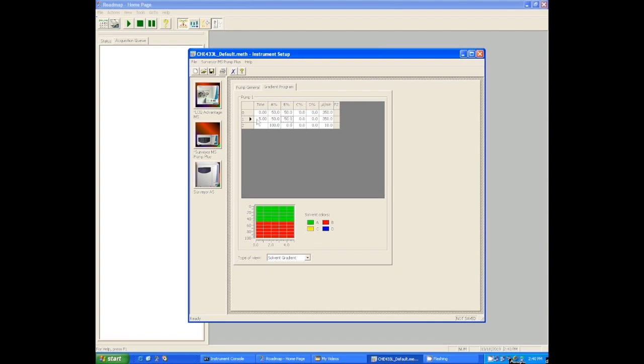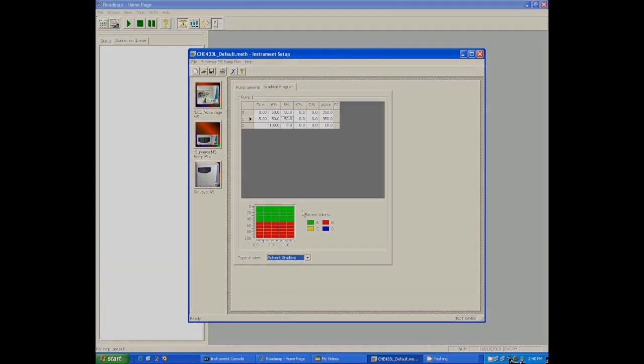Now make sure you check the flow rate throughout your whole method to make sure that the flow rate stays constant. We're going to get 350 microliters per minute.